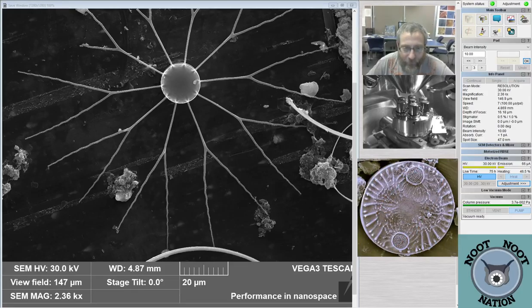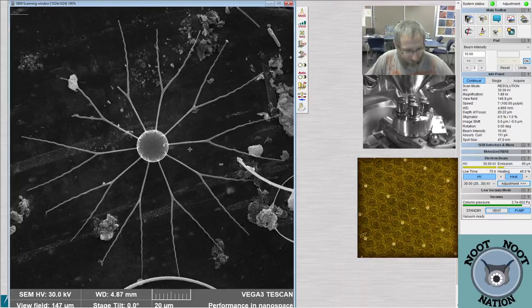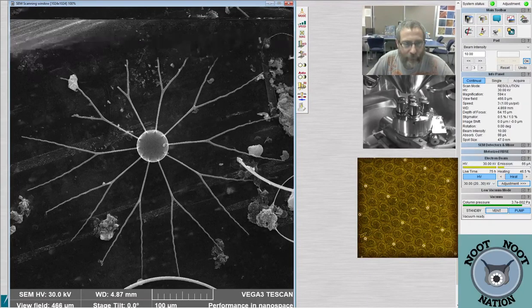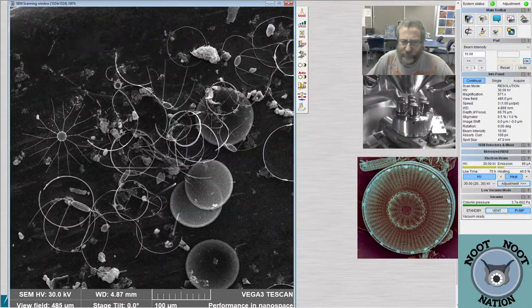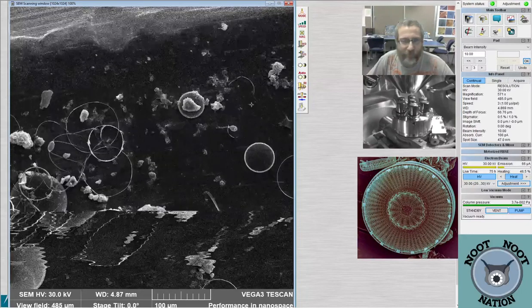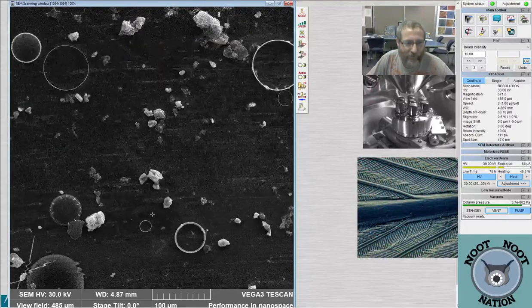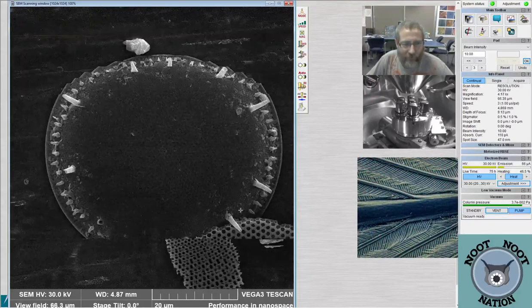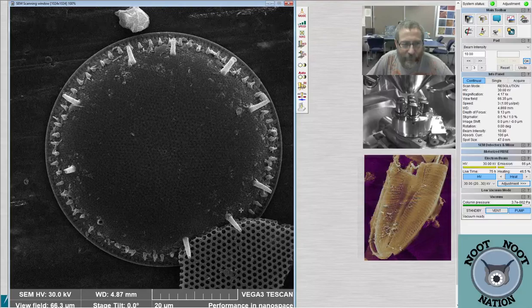So, earlier when we were looking at that weird stack with those funny little connecting bits, I was just looking more carefully at the joining spines between these bacteriastrum. You think maybe it could have been bacteriastrum that just had its other bits broken off? They're really strange. I don't want to say no, but I don't think so. This one's got crazy tubes coming out of it. Tubes for days.